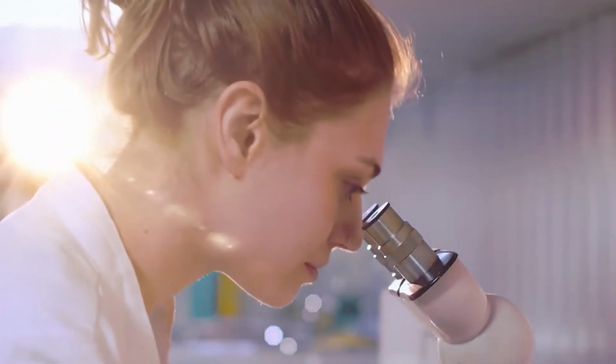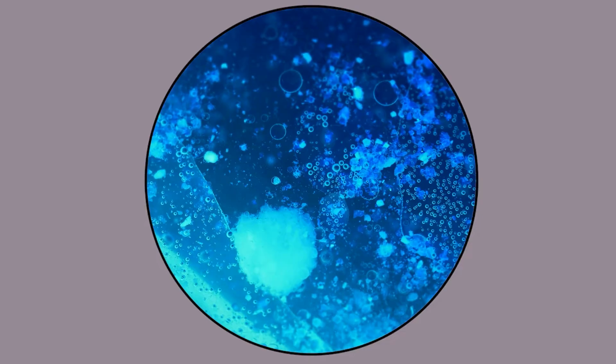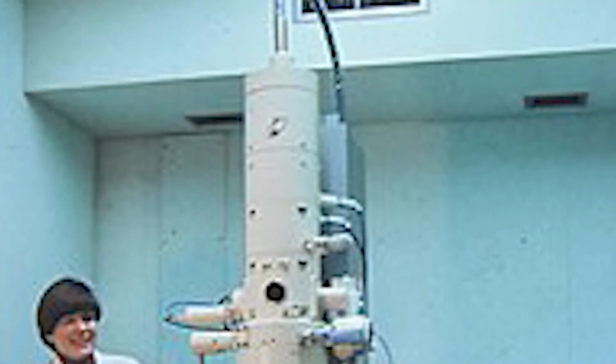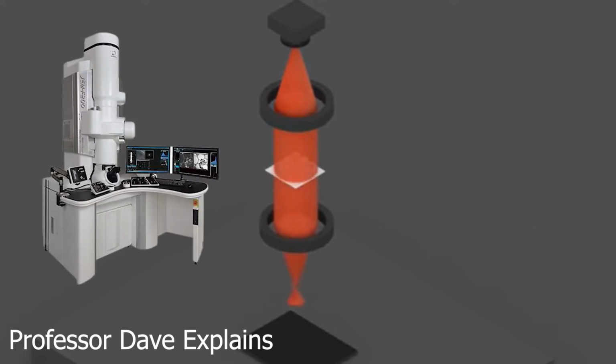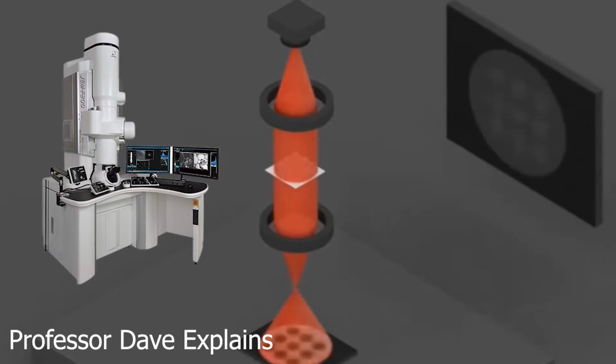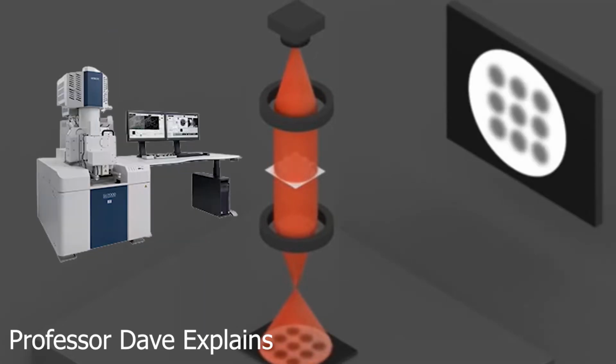One method for getting high-resolution photographs of both biological and non-biological specimens is electron microscopy. They are microscopes that provide an image that has been enlarged by using an electron particle beam to view specimens. There are two basic kinds of electron microscopes, the transmission electron microscope and scanning electron microscope.